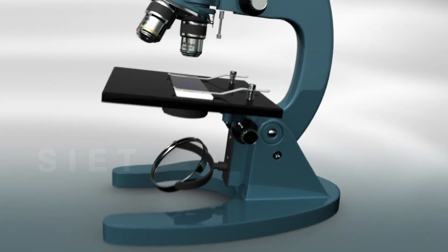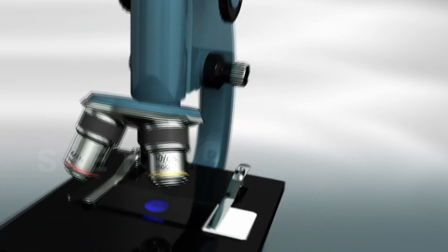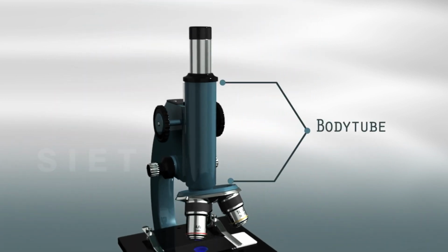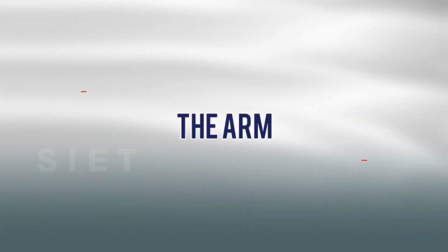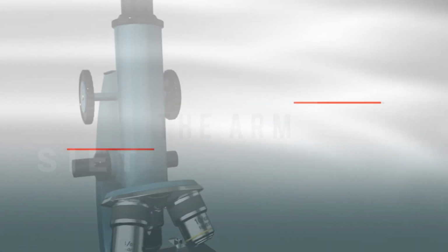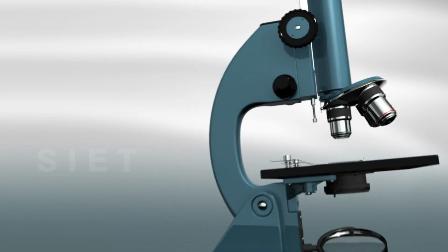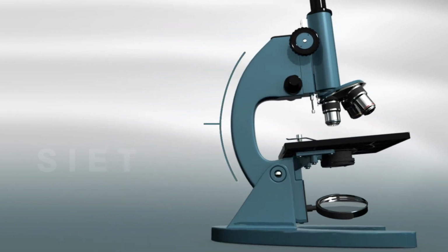Body tube. The body tube may be straight up and down or slanted. The arm. It is the curved metal piece that holds the body tube in place over the stage and the base.